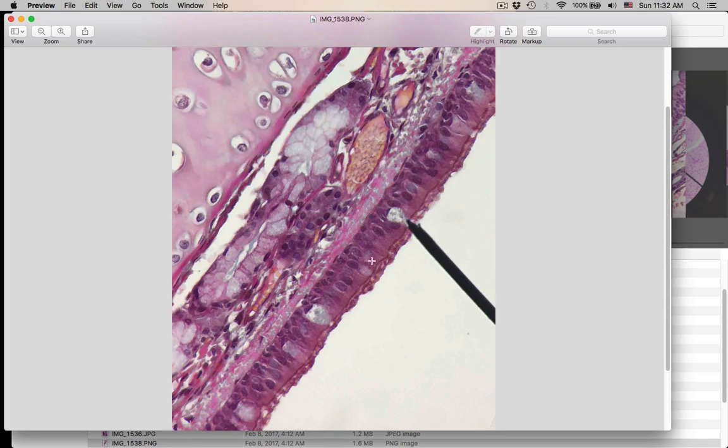And in this type of tissue that you see here, this type of epithelium right here, and you can kind of get a hint, there's something over here too, a connective tissue. What is the function of what these white cells are making? What is this function in this kind of tissue?